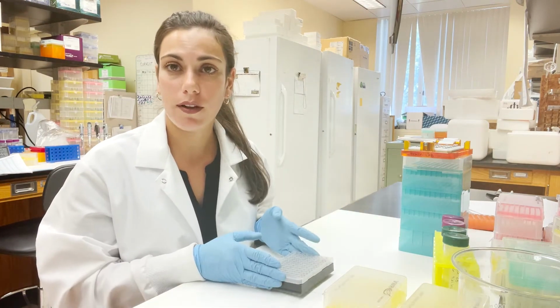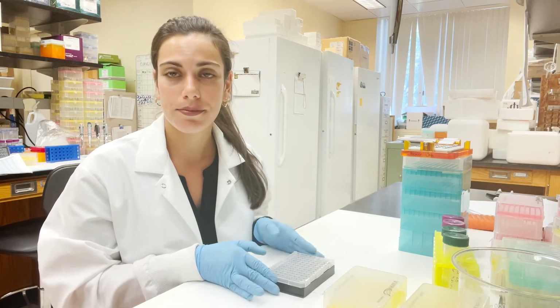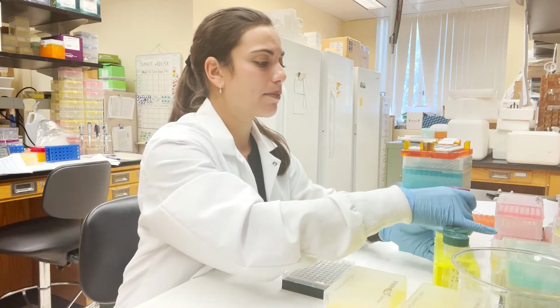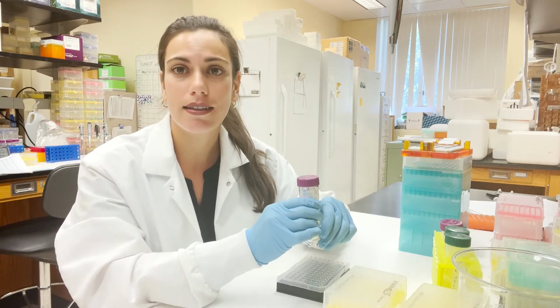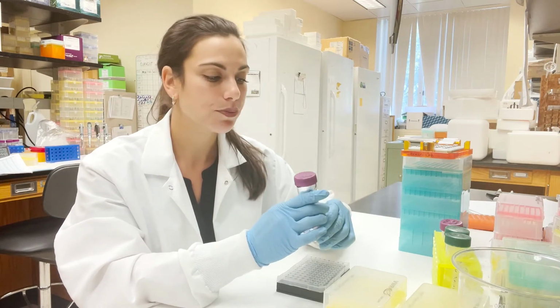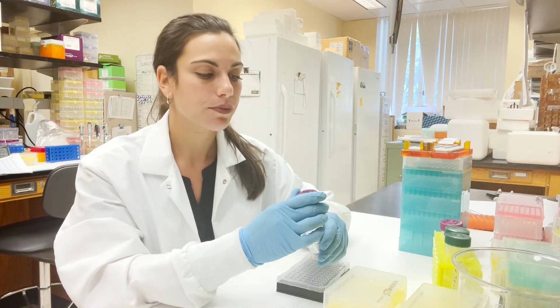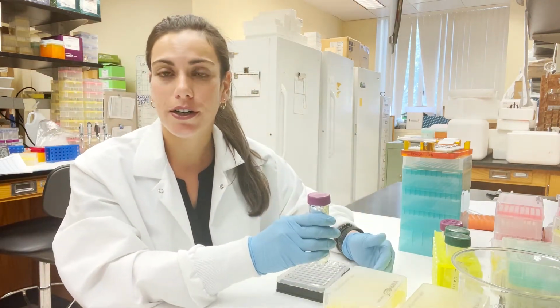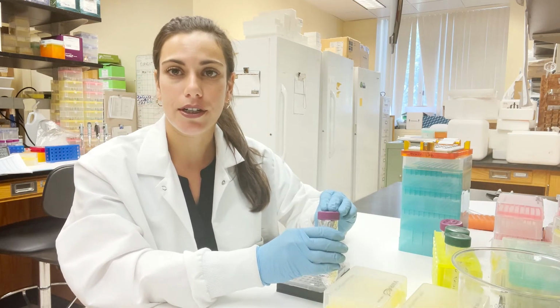So after we've mixed all of our beads into the solution, we let it incubate at room temperature for 5 minutes. Now, what I forgot to mention before about the beads is these beads have been adjusted to a concentration that is appropriate for our method so that it can size select the DNA that we want. Now, this needs to be developed in every lab before you develop this protocol. And then these are aliquoted out into bottles that we know come to room temperature after waiting 45 minutes. So before starting this protocol, I brought them down to room temperature and then vortexed for 1 minute.